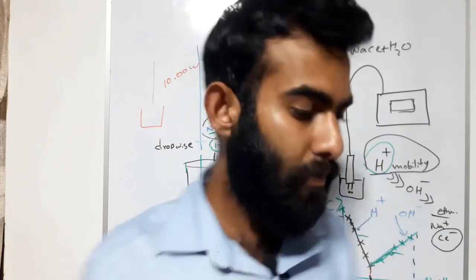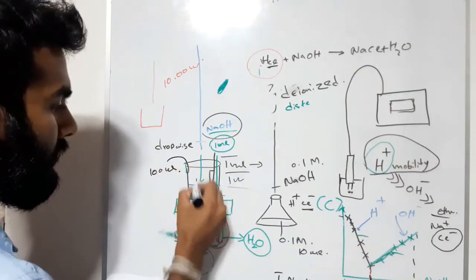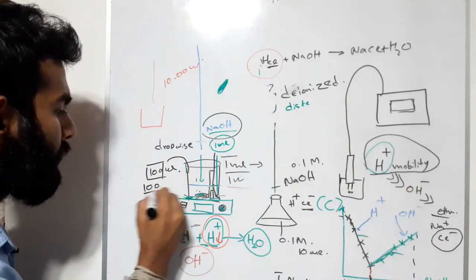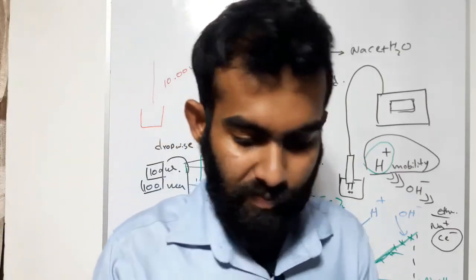We add 100 ml of water into this beaker to adjust the volume. We just mentioned 100 ml, not decimal points. So we are using a measuring cylinder to measure that water. Okay.